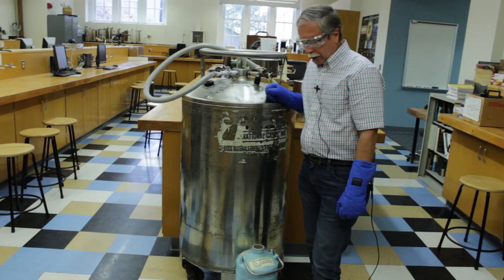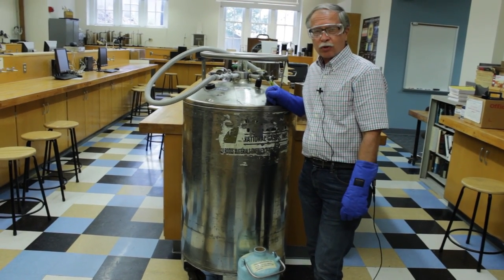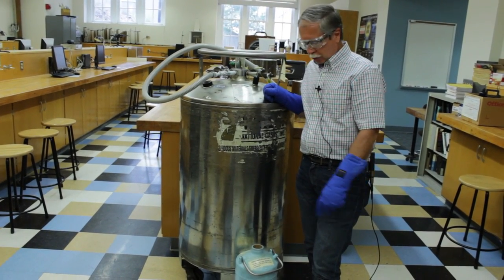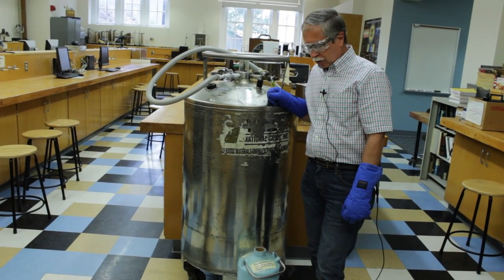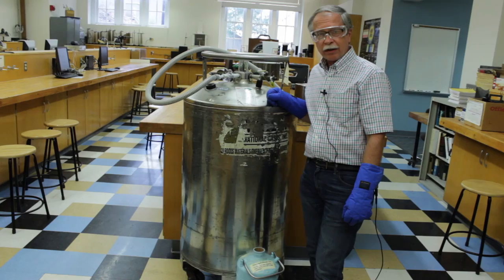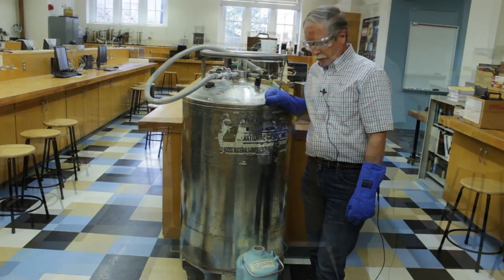Cryogenic fluids are a real hazard. You can get some serious frostbite if you're exposed for a prolonged period of time to the liquid nitrogen. So we want to handle it safely and minimize the chance of injury.